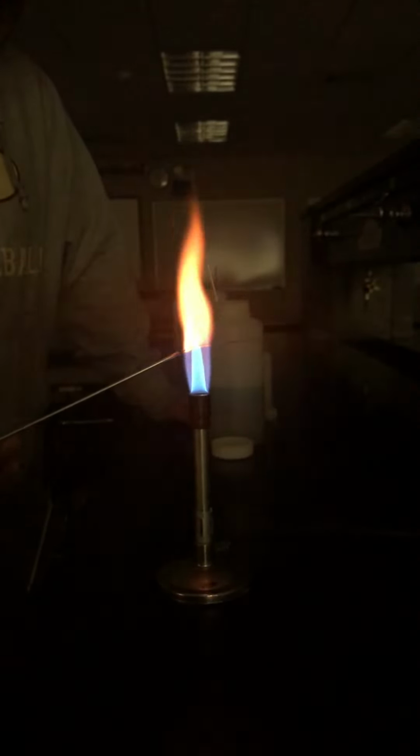Then our last one is copper. Okay? So the last one is copper. Oh, green, blue. Look at that go. Yes. Green, blue. Whoa, that's cool. Look at that.